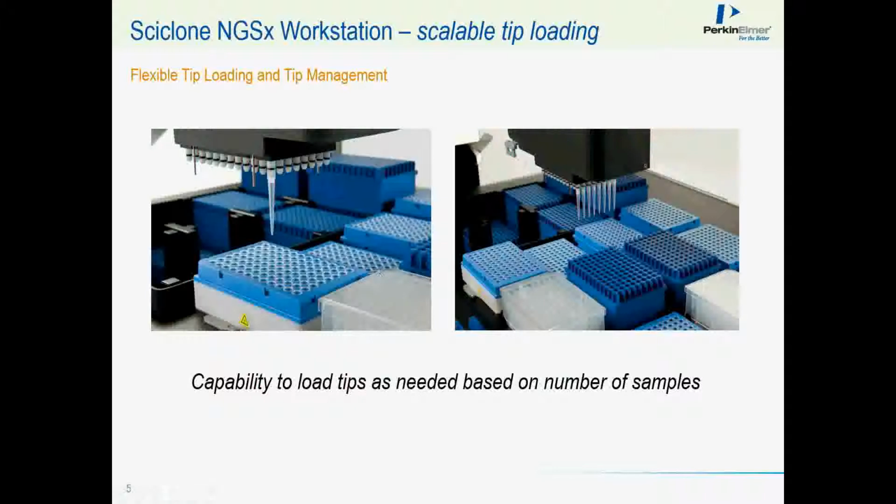And so the head has the ability to pick up a single tip as well, based off of the tip box design. You may notice in the right picture that the edges of this tip box are scalloped on the side. This tip box design was made on purpose so that if you did need to load a single column of tips or a single tip, for example, for indexing or barcode broadcast, you have that ability to pick up a single tip, aspirate the index adapter of choice, and then distribute them to various wells.